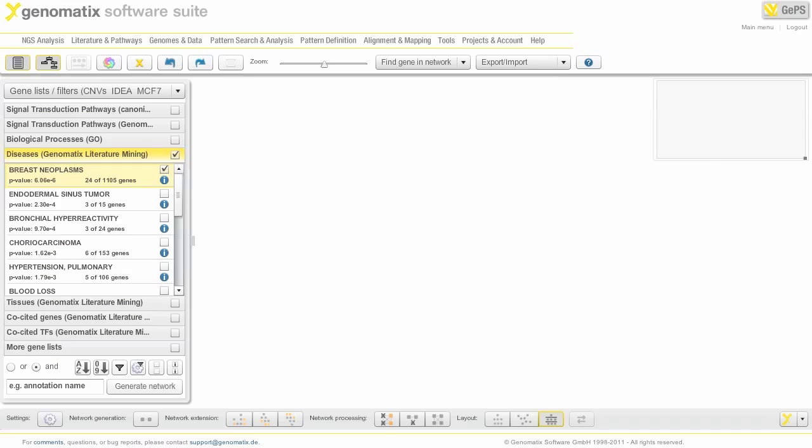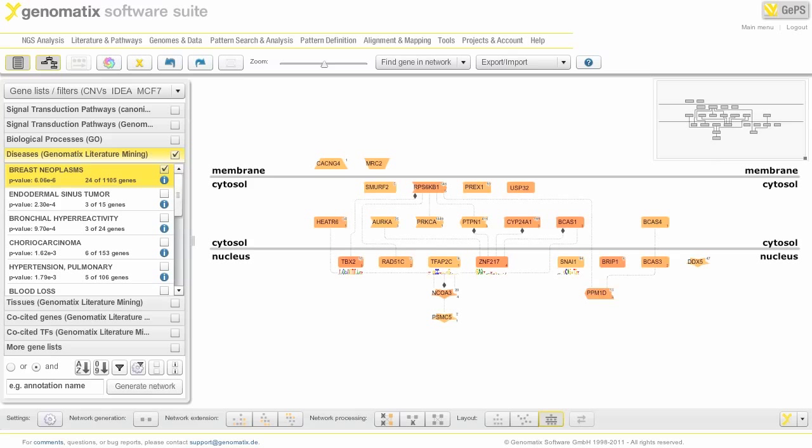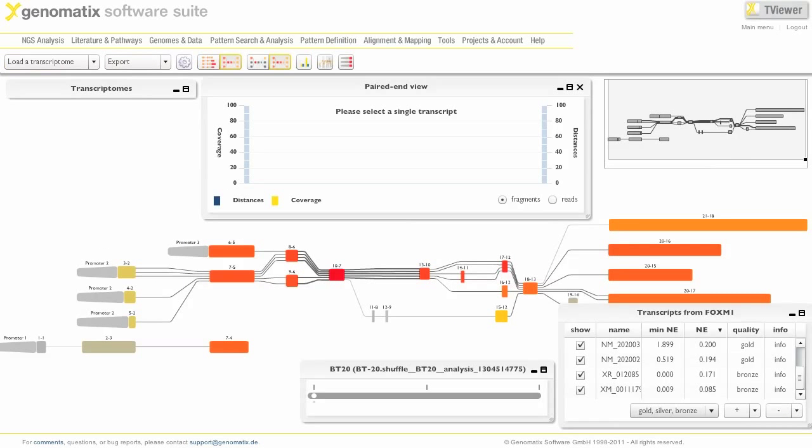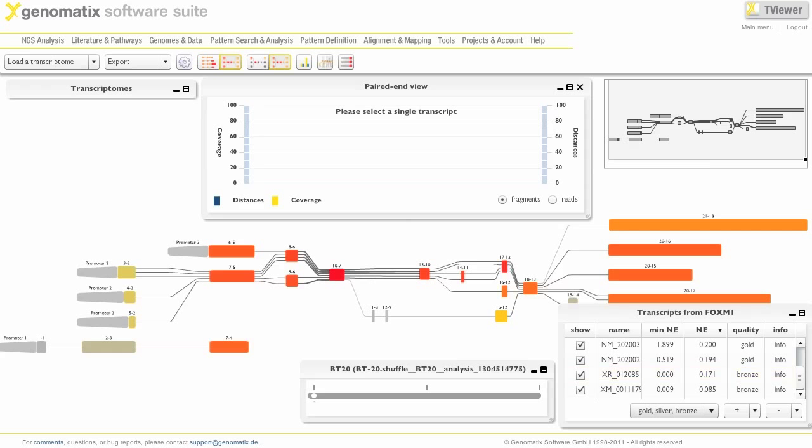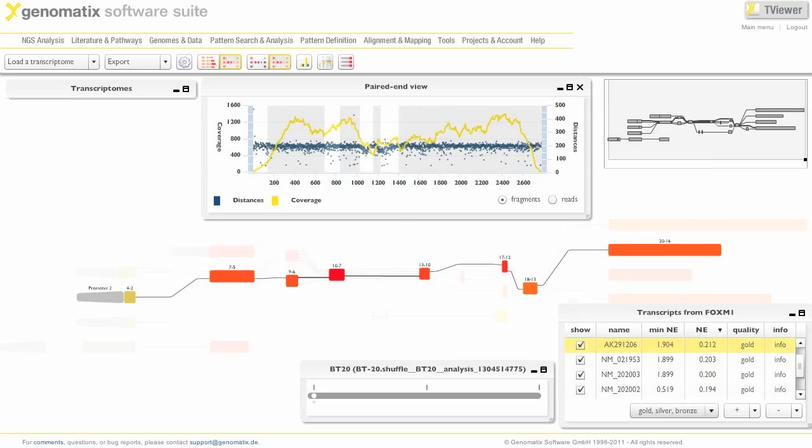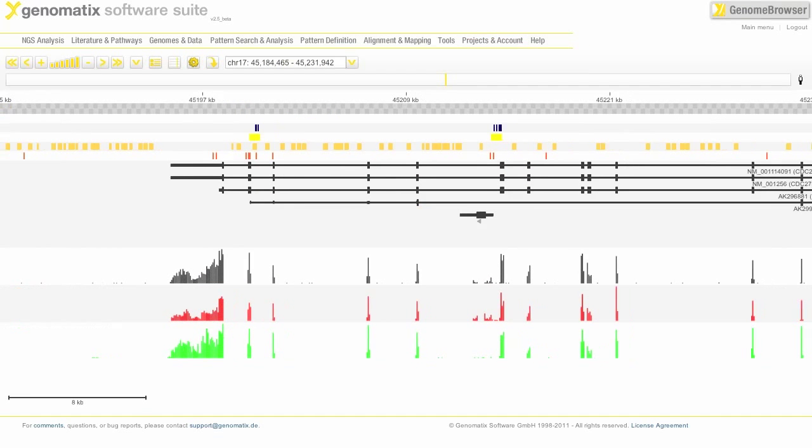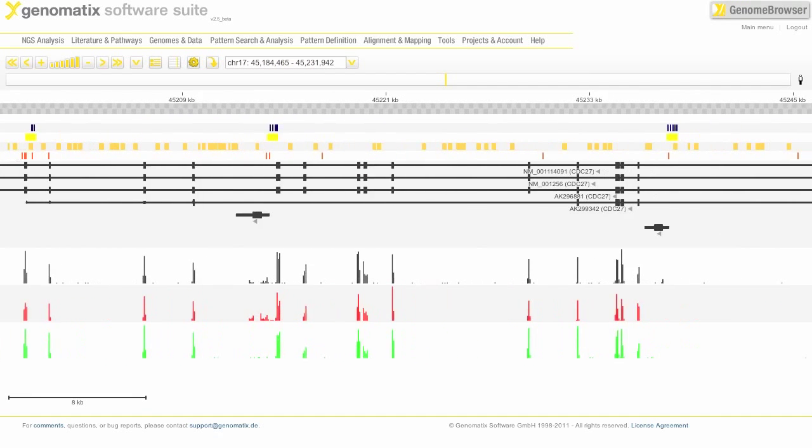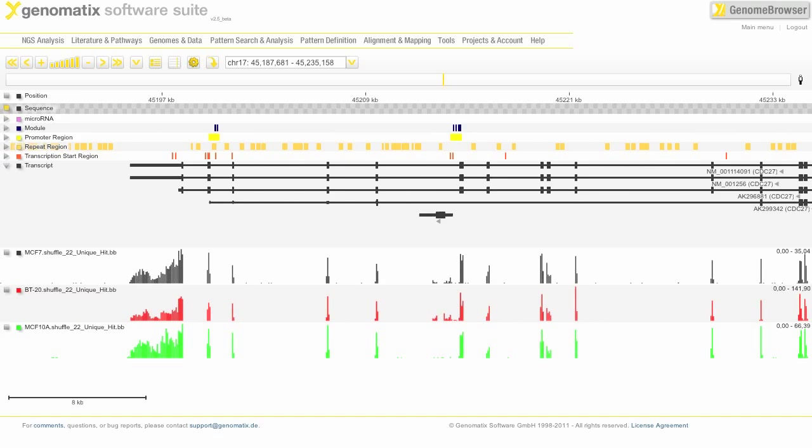Another thing we can look at are networks, based on the differentially expressed genes. Here we see a breast neoplasm network. We can view the data in the transcriptome viewer. This is, for example, FOXM1. We can look at expression profiles for different transcripts here, or we can have a look at the data in the genome browser to get an overview of what exons are expressed in the different cell lines.